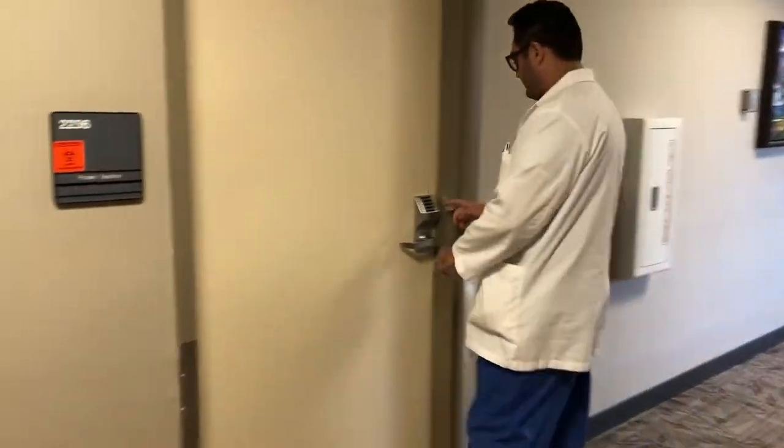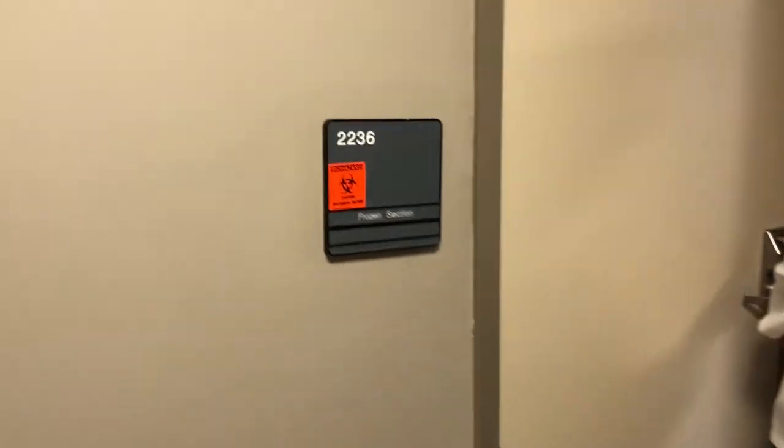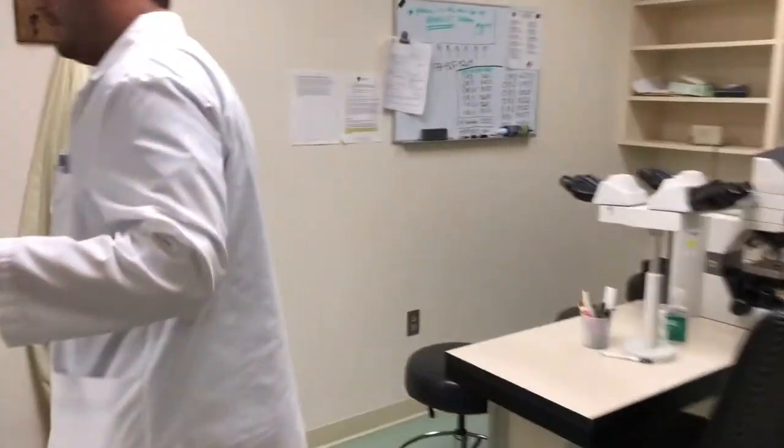Good morning and welcome to the frozen section introductory video. We will try and explain the basics of a frozen section to help you when you first visit.